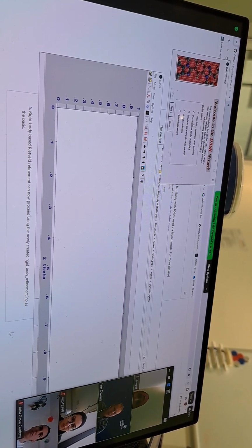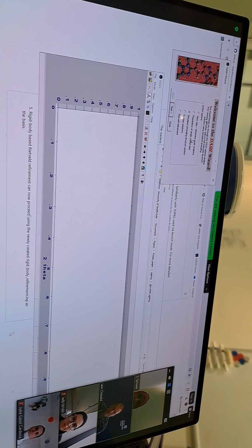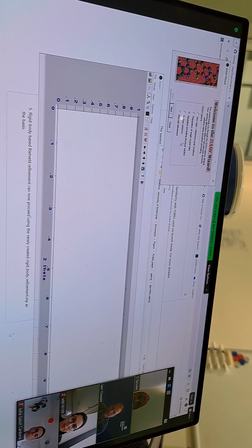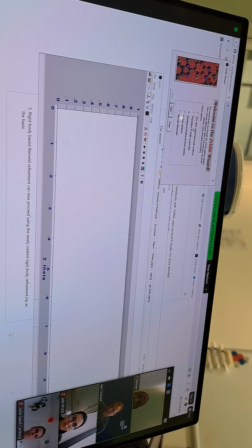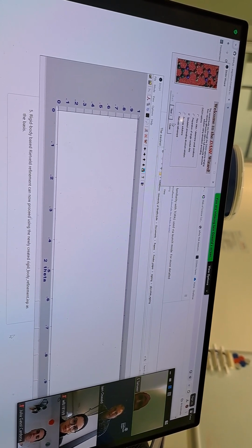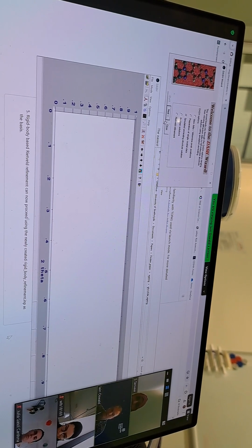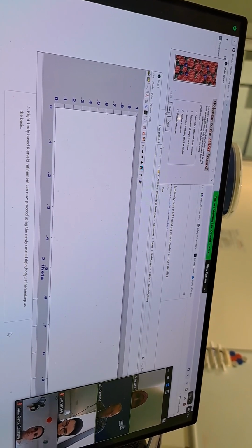For each of your powder patterns, we can go through this process of viewing data, determining peak positions and so forth. By doing that, you get a .sdi file out, which is all the information that you've got to that point.